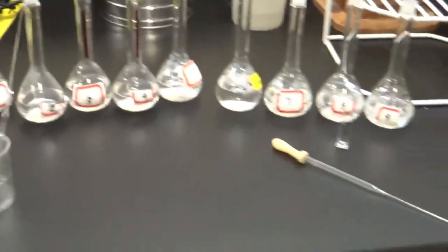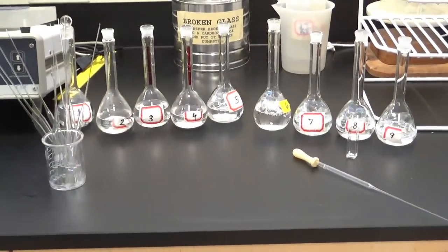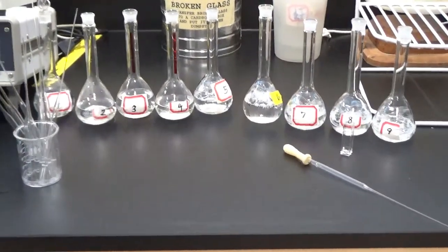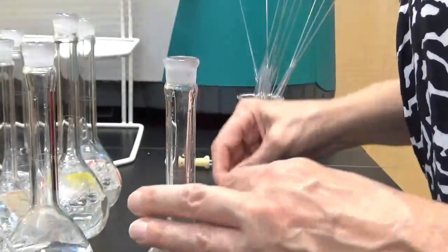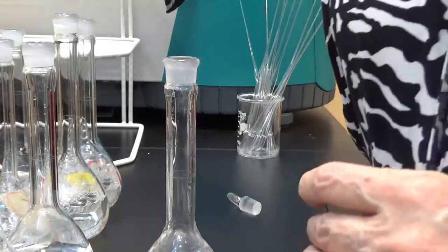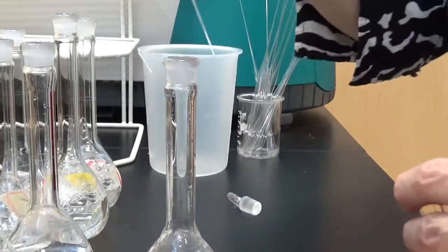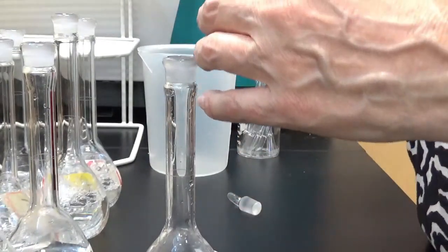So that's my overall goal, and I'm going to show you some of it, but it's a little hard to do it with one hand, so we'll see how this goes. Alright, so here's my cell that I'm going to be filling with solution 1. I have a nice clean pipette to fill the pipette with solution 1.